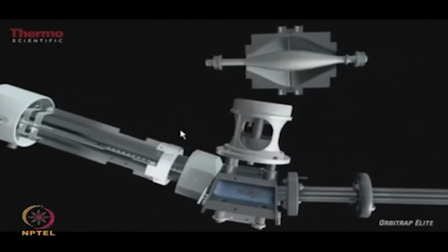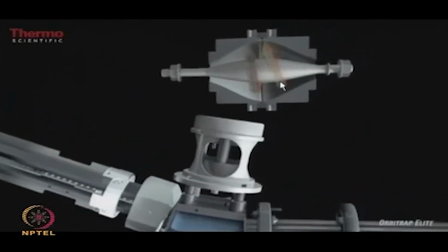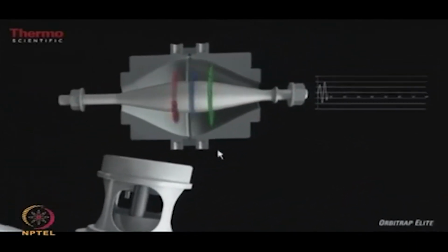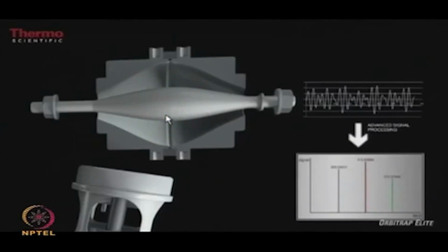The C trap cools the ions and makes them into a packet of ions, so that the packet of ions is injected into the Orbitrap. Because the Orbitrap itself is a static field, you have to inject the ions tangent to the field. Once the ions go into the Orbitrap, they move in orbit, and the frequency is recorded, which in turn gives you the mass spectrum.